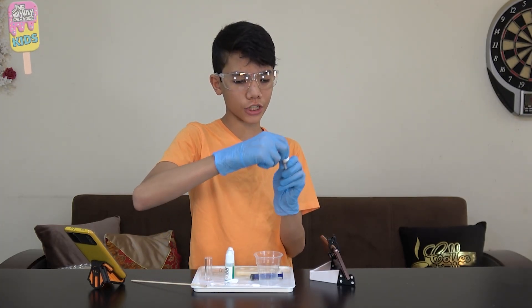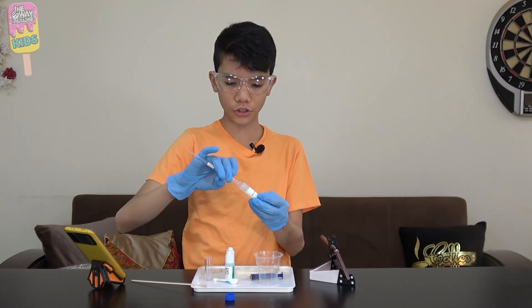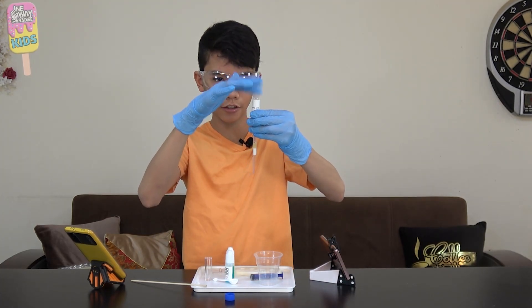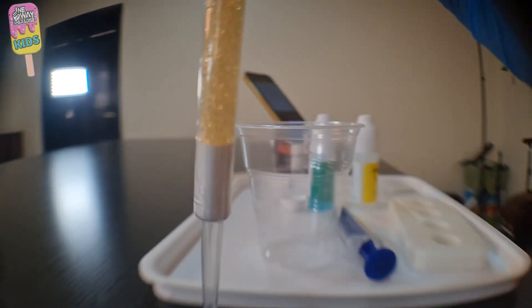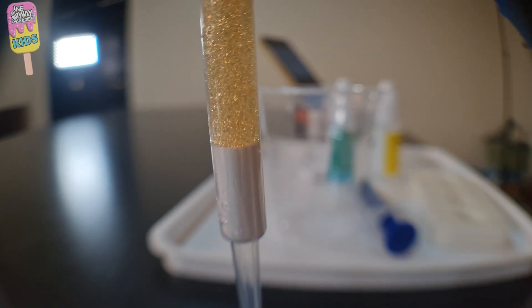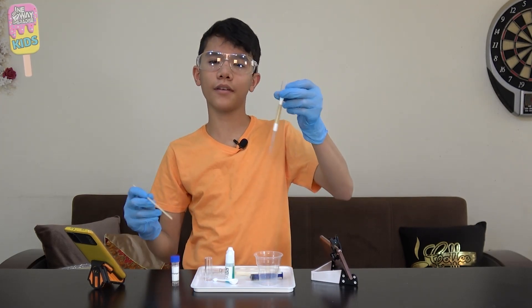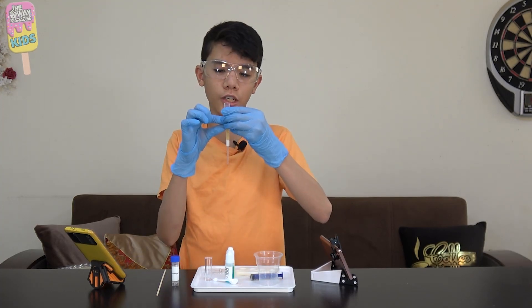Then I'll open our ion exchange resin. I'm gonna put the wide end of the filter body and insert it inside of the vial, then tilt it to collect some of the resin — there it goes, it looks like fish eggs. I just have to tap it to get all of it inside, and then I'm gonna insert another cotton cylinder on top of the resin. I'm gonna squeeze it all the way because last time the experiment didn't filter properly because there was a gap between the cotton cylinder.